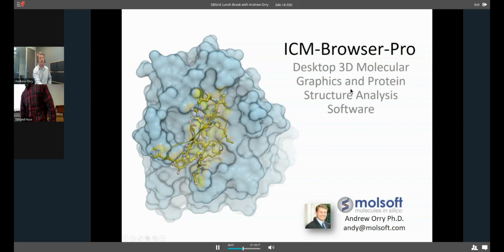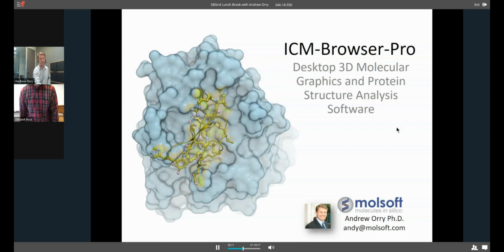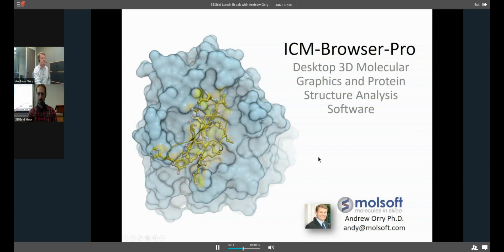Today I'll be talking about ICM Browser Pro software, which is a desktop 3D molecular graphics and protein structure analysis software. If you have any questions during the webinar you can text them as we go along and I'll try to answer them at the end. After the webinar, please feel free to email me at andy@molsoft.com.